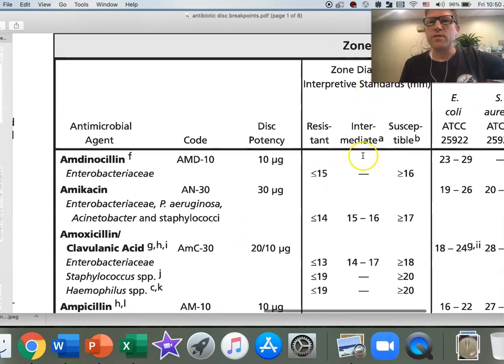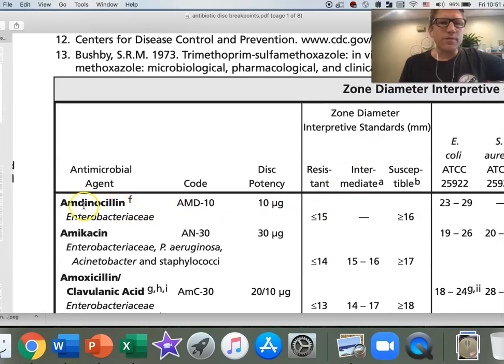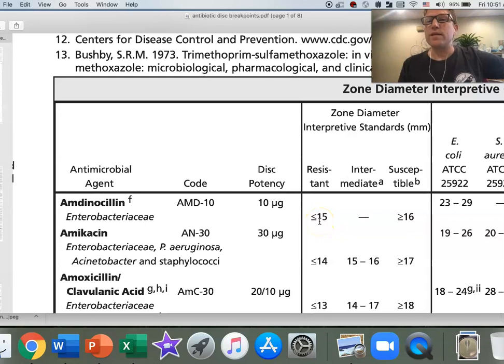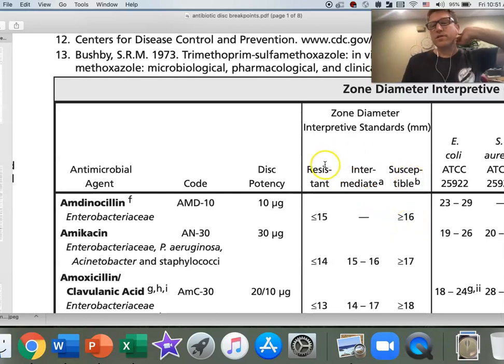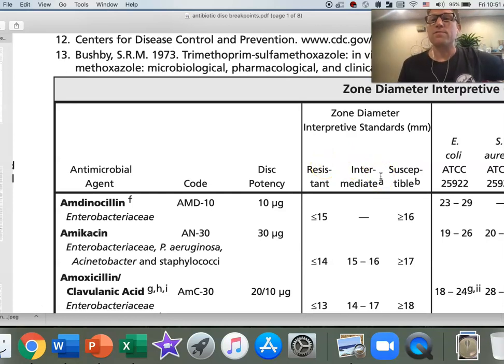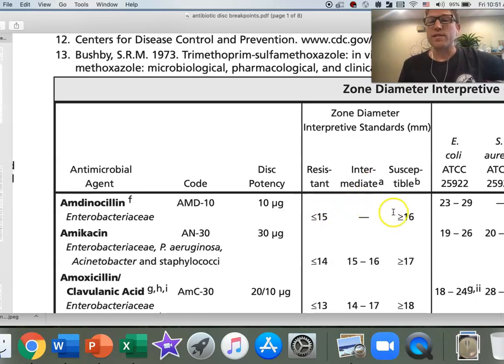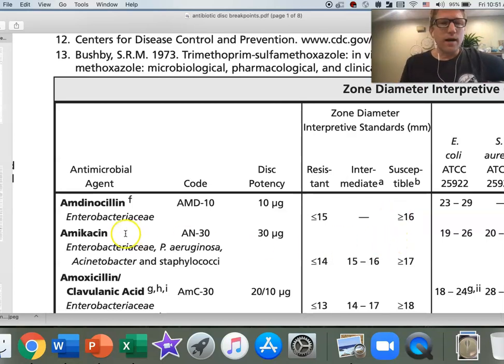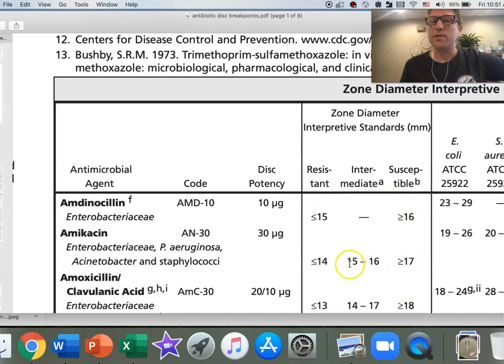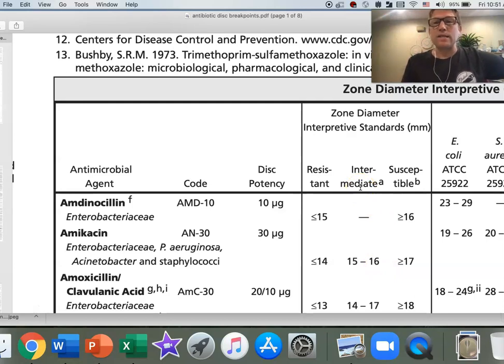Over here, we've got zone diameter interpretive standards. These are the breakpoints. If we were using amoxicillin, less than or equal to 15 millimeters diameter, we're calling it resistant. Greater than or equal to 16 millimeters, we're calling it susceptible. These terms resistant and susceptible really are based on empirical evidence, experience with how frequently the drug works when we see halos at these sizes in a live patient. Amikacin has 14 as its resistant breakpoint, 17 as susceptible, and everything in between, 15 or 16, they call it intermediate, meaning sometimes it works on the patient, sometimes it doesn't.